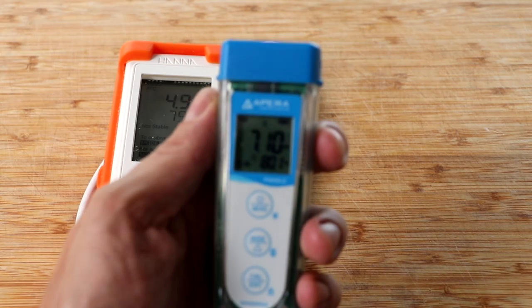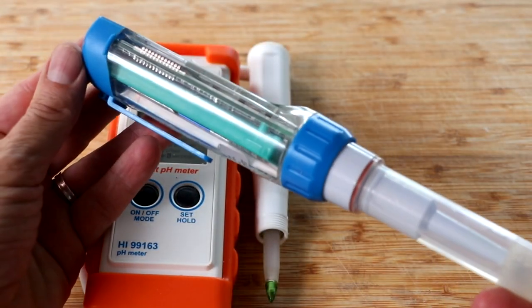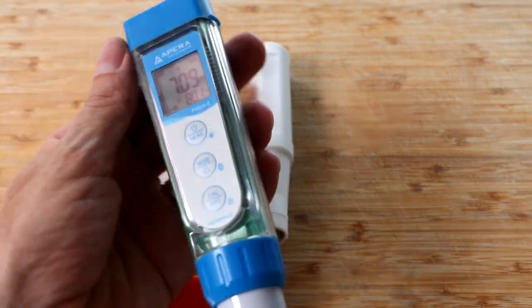Unfortunately my model doesn't have that capability, so the only way I'm going to know whether or not I need to change my probe is if I get some really faulty readings and it starts to consistently affect my salami.